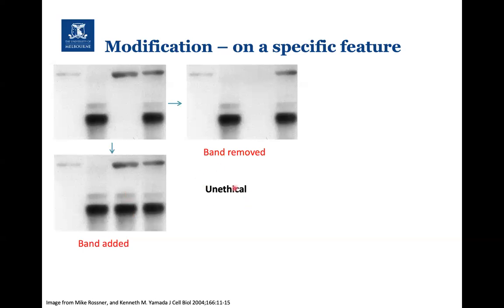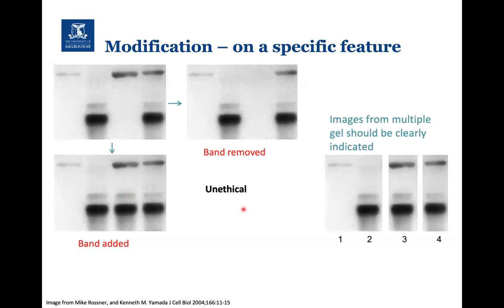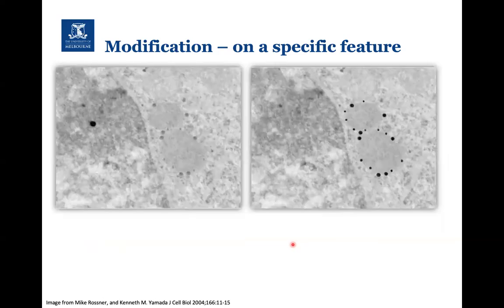Obviously, these are unethical things to do to your images. The other thing to bear in mind is if you have gels, or images, taken from multiple gels, then they need to be clearly separated out, so that's made really clear.